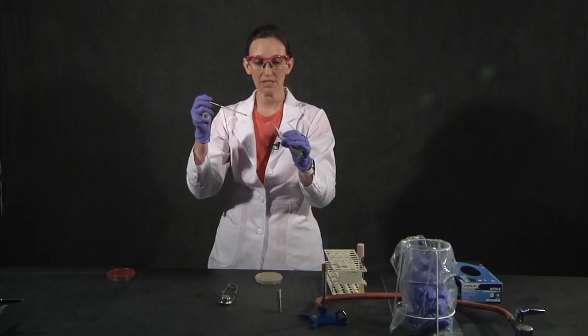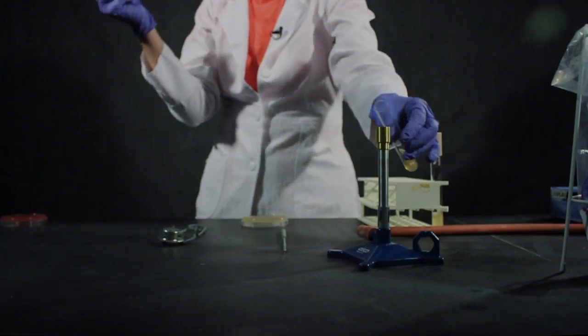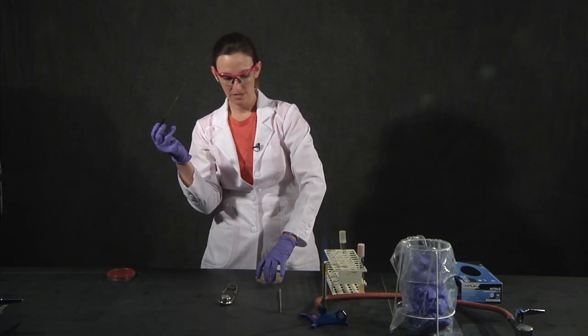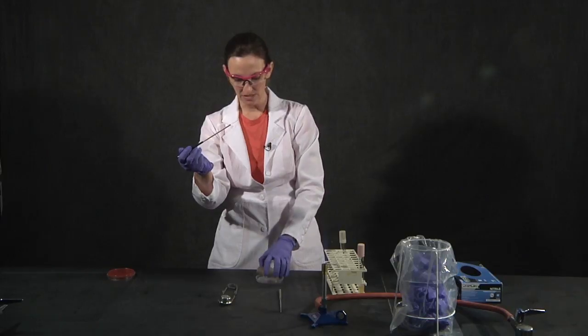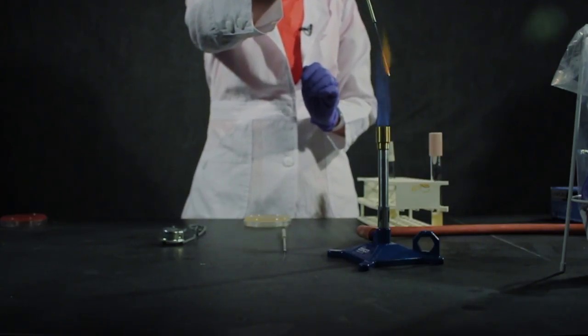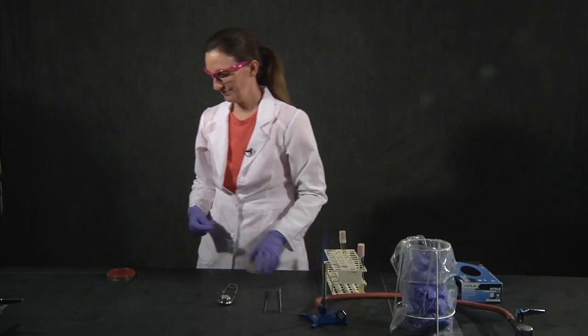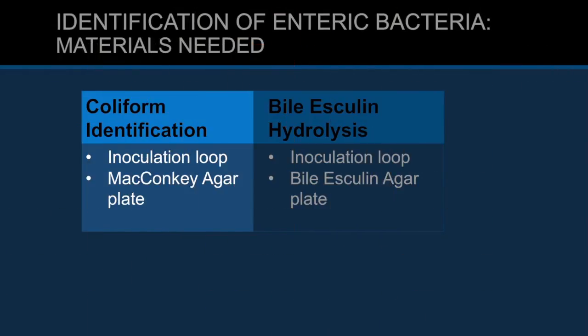I have my organism here — the working stock — and I'm just going to do a straight streak right down the middle. That is going to give me a heavy line of growth. I'm going to incubate that for 24 hours at the optimal growth temperature. The MacConkey agar is a good time to practice your streak for isolation technique because we want to see the color change in individual colonies.